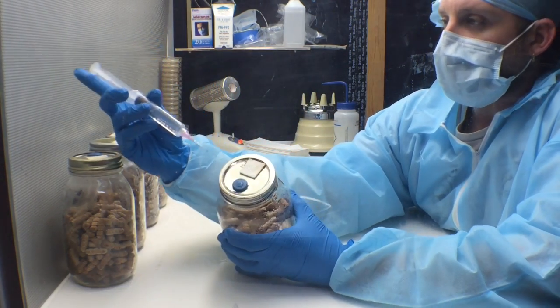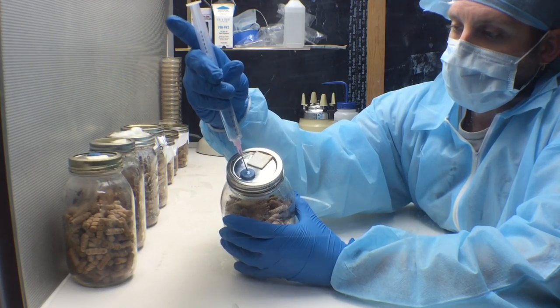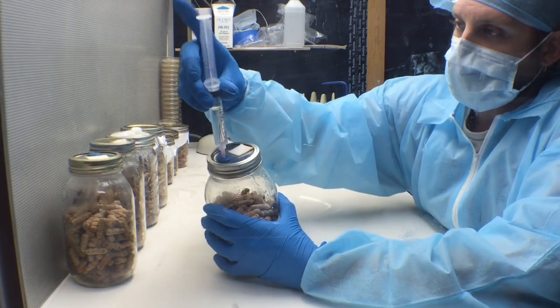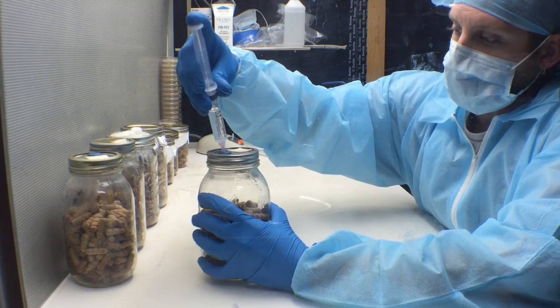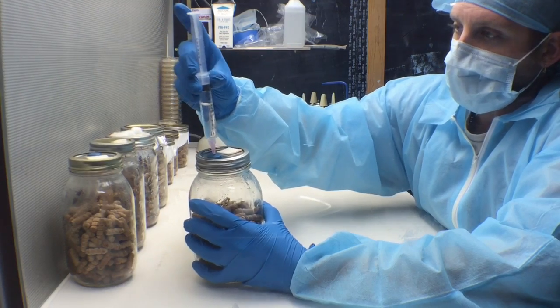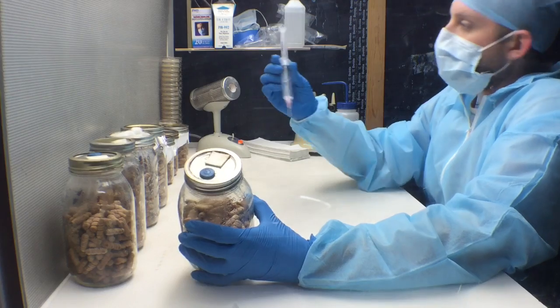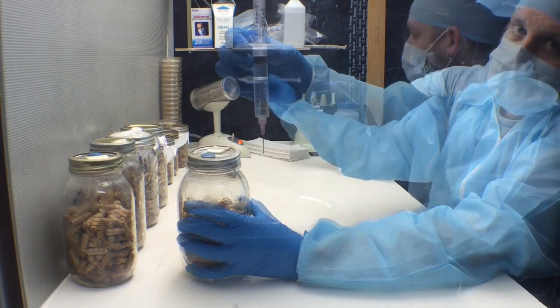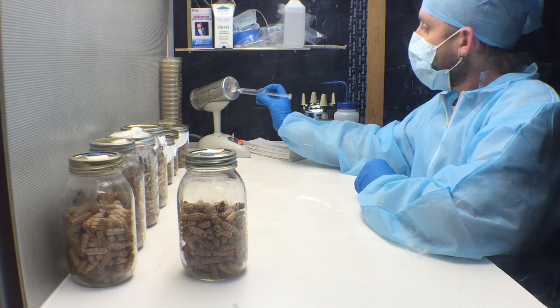What you're going to do is insert the needle into the injection port and squeeze in 1 cc of liquid culture. Since we only have one syringe of this liquid culture, we're only going to do 1 cc so we can save a little bit. These will be our starter jars to expand the culture.